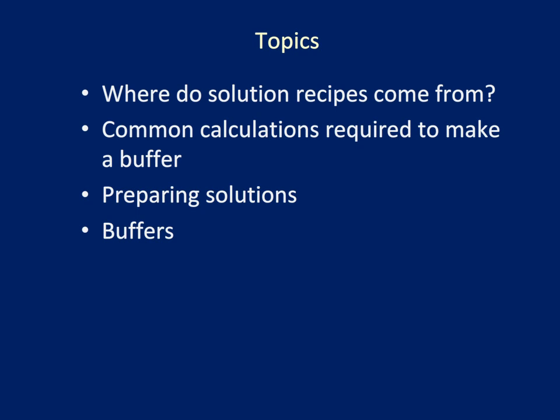Today we're going to talk about solutions and buffers. First we'll discuss where solution recipes come from. Then we'll go through several common calculations required to make a buffer. I will cover preparing solutions. And finally, I will briefly discuss buffers, which will be mainly a recap of what you've learned in biochemistry lecture.